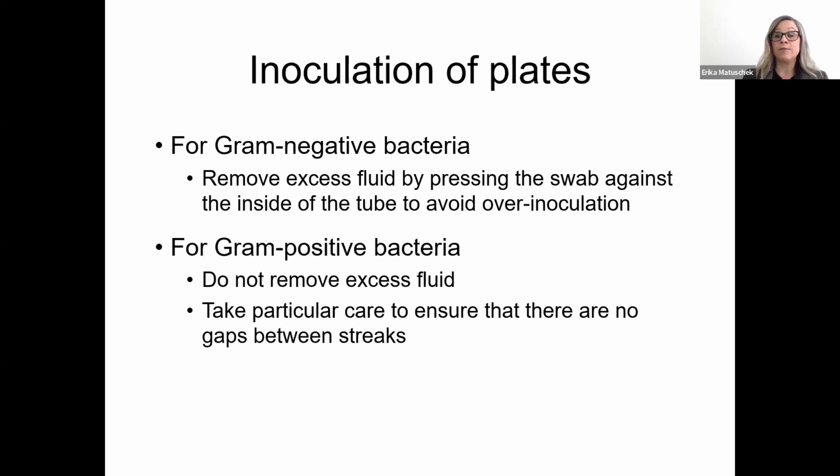For gram-negative bacteria, you should remove excess fluid from the cotton swab by pressing and turning the swab against the inside of the tube to avoid over-inoculation. For gram-positive bacteria, we recommend that you do not remove excess fluid and that you also take particular care when you streak the plate to ensure that there are no gaps between streaks, meaning you should take it a little bit slower and maybe streak one more layer to get a nice confluent growth.